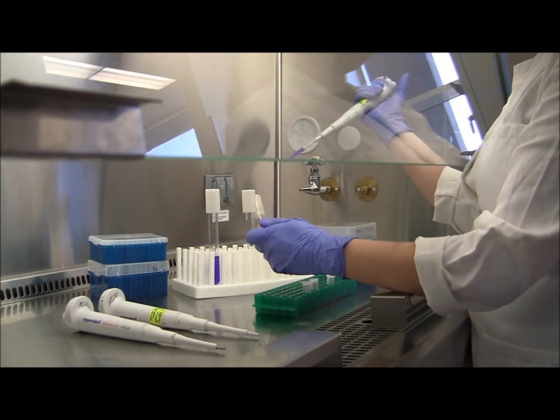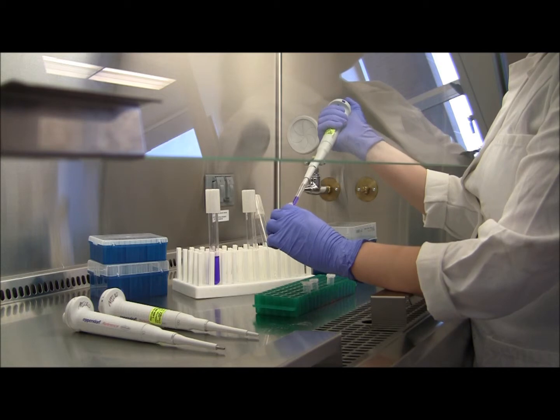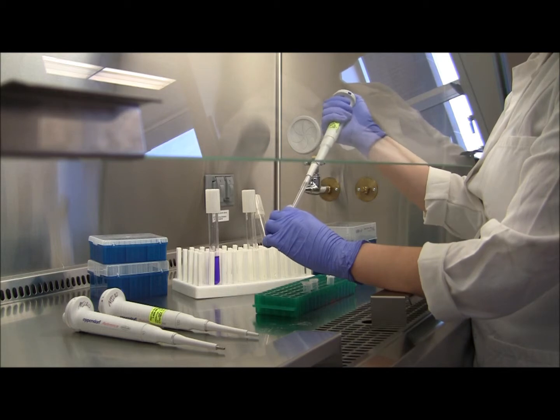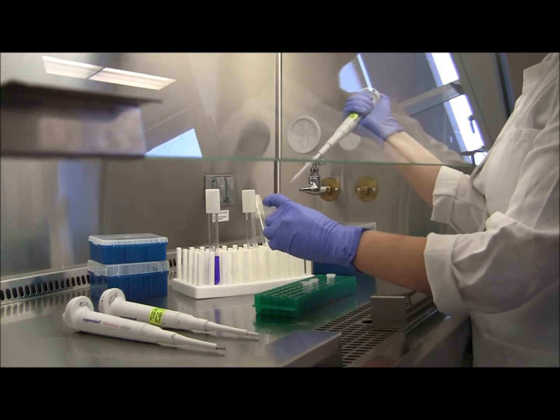Now we're just going to take our Eppendorf tube. You'll put your tip into the tube, and then you'll press the plunger down to the next stop past the one that you used to get the liquid.